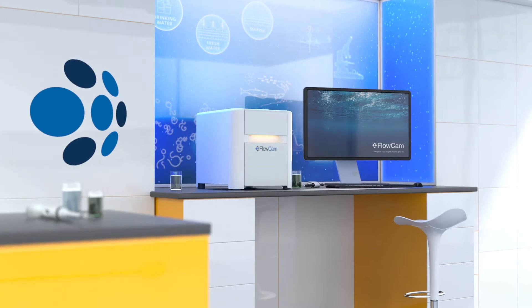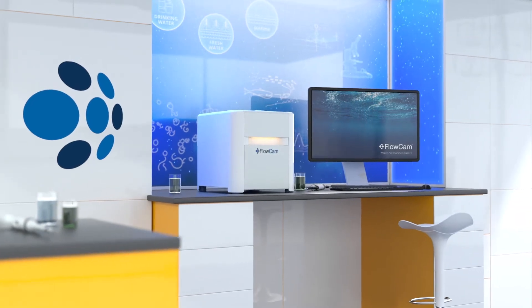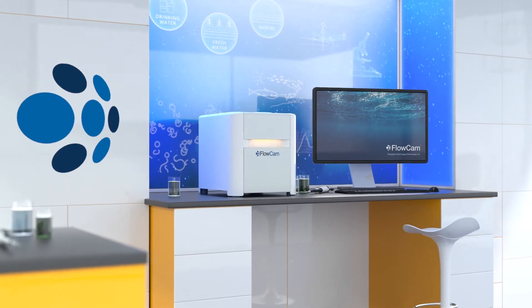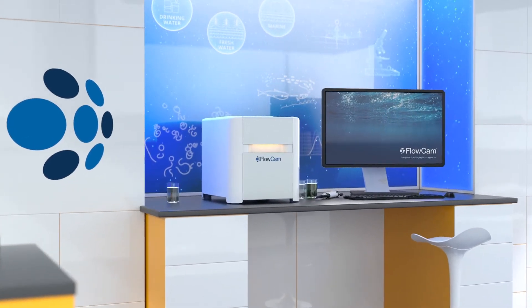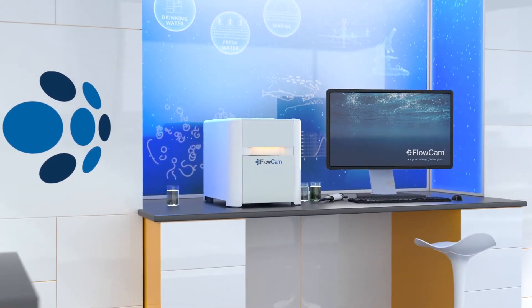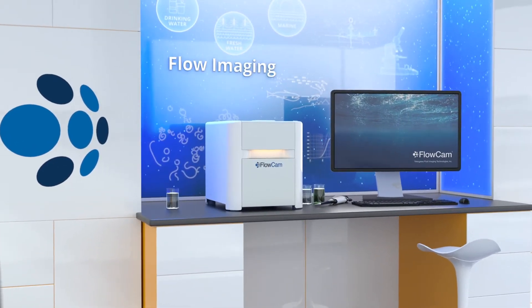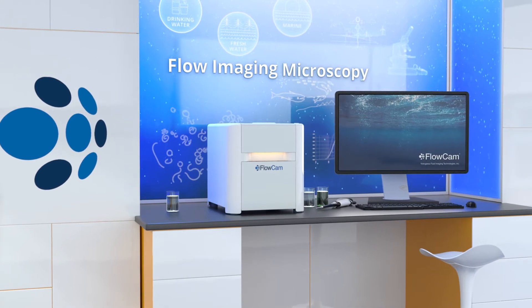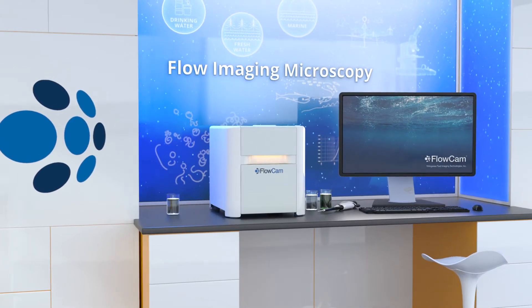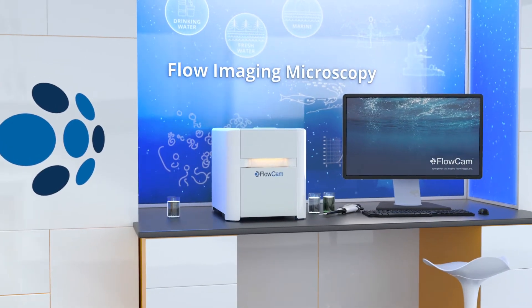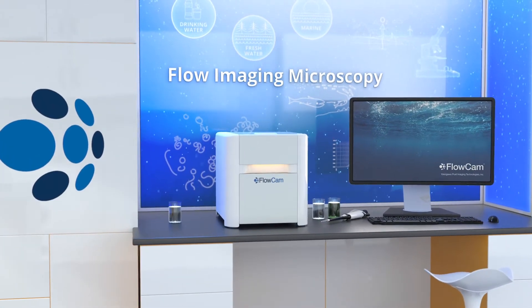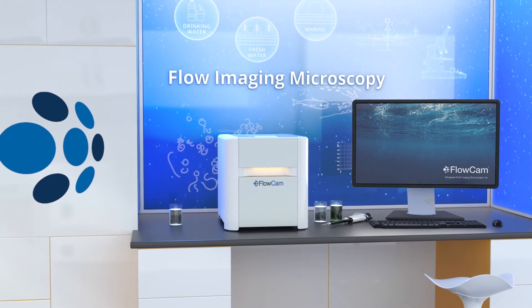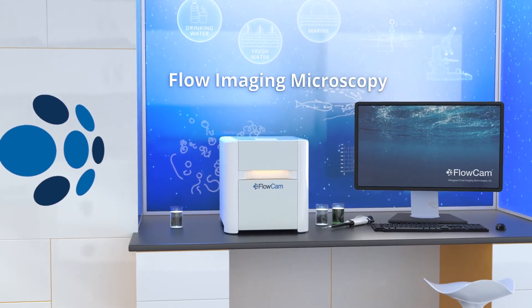This is where the FlowCam comes in. The FlowCam's revolutionary technology combines the benefits of digital imaging, flow cytometry, and manual microscopy into a single instrument. Here's how it works.